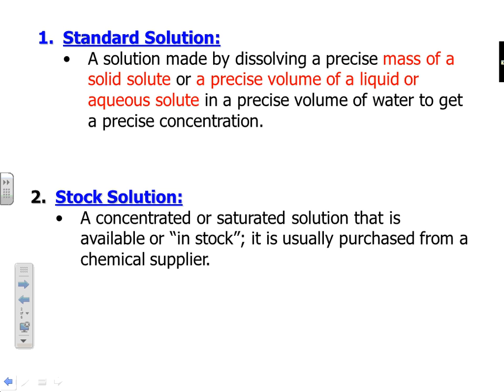And the line is actually etched in the glass. I can actually rub my fingernail. I don't know if you can hear that. There's a little line etched right in. And that line, when you get the bottom of the meniscus, all right, now the meniscus is kind of that surface that the water makes, and it always makes kind of a curved surface.